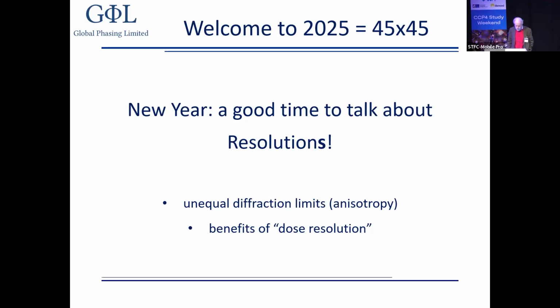But New Year is always a time to talk about good resolutions. Notice the S, because I will be talking about a new type of resolution, dose resolution. So this may be a hairy idea, you'll tell me. But I will also be talking about a more commonplace case where resolution is a dirty word unless it's replaced by diffraction limits, namely anisotropy.